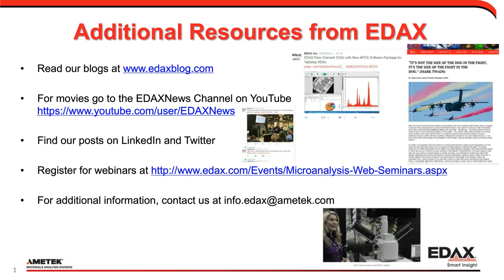Most EDS manufacturers report quant data to 0.1%. What is a realistic level of accuracy that we can expect from a typical EDS with SDD? Very good question. So yes, the 0.1% is a good rule of thumb for all elements from sodium and above. As you know, sodium and below is a little more challenging because of the low energy of the X-ray and the high amount of absorption.